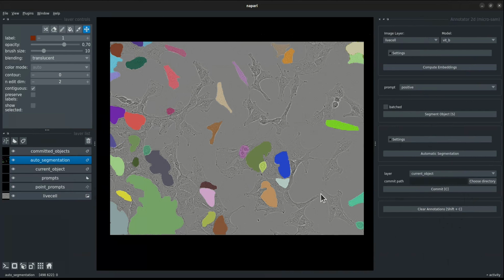And there we go. We have our segmentations obtained. We instantly observe some missed segmentations, some incorrect segmentations. Let's go ahead and rectify them. The first thing we do is choose the pick mode to choose the background to eliminate the wrongly segmented objects with the fill mode, and there we go. And with a few clicks, you can quickly remove them.